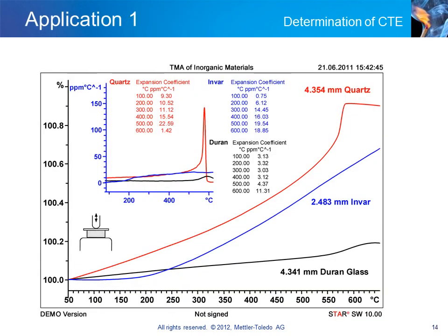Materials expand or contract as a result of an increase or decrease in temperature. They exhibit different expansion and contraction behavior in different temperature ranges. The possibility of dimensional changes due to temperature change must be taken into account when designing composites from different materials and in many engineering applications. Otherwise, cracks and damage can occur and lead to product failure.